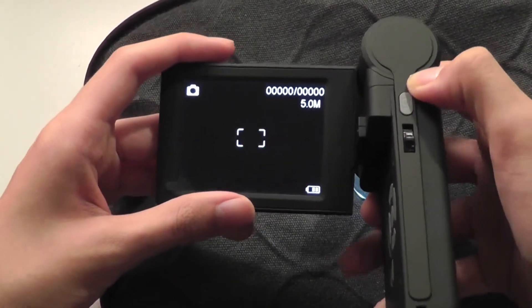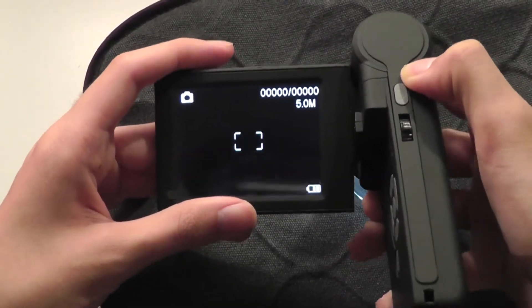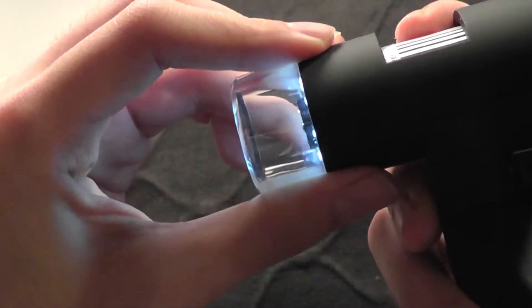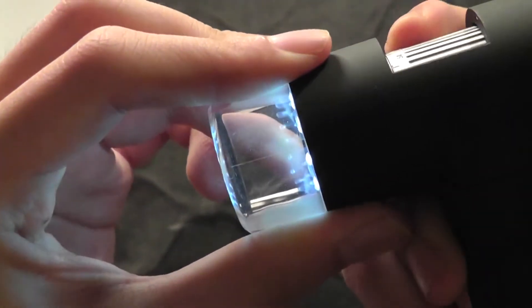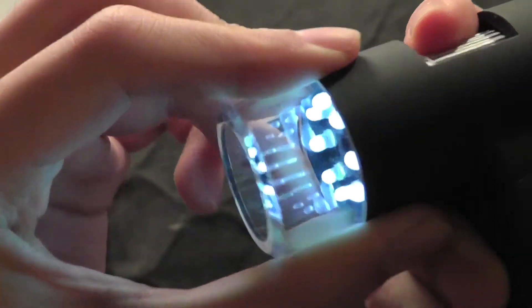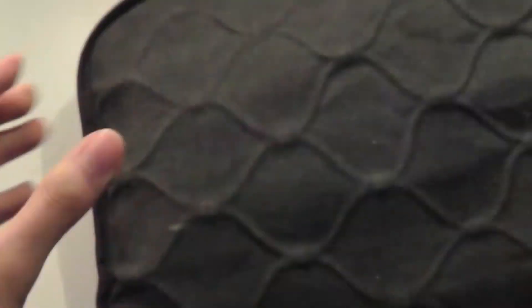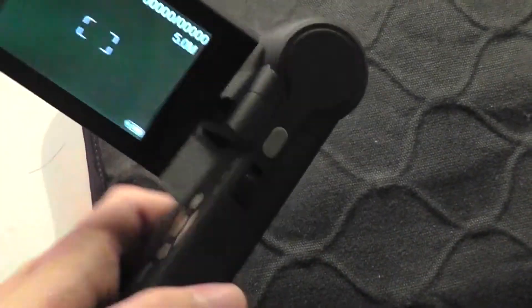This is a bit of a dark environment. It's trying to find where the device is. We can zoom using the top scroll wheel here, and you can see how the camera itself will actually move up and down and try to find the actual location. We can try something else.